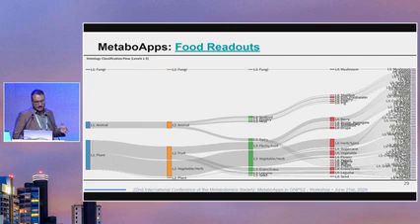So basically, it goes from level 1 to 5, and the first one is really, really broad. You're looking at fungi, animal, and plant origin of the food. Then you have more detail on level 2. On levels 3 and 4, you're looking at classes of foods.